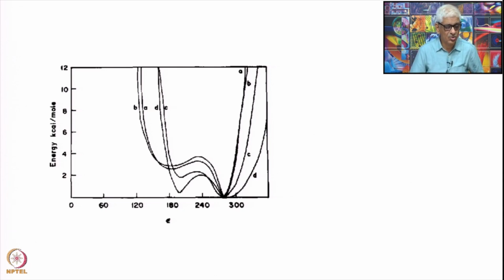Now we turn to one of the torsion angles along the backbone, and that is the epsilon torsion angle, the C3 prime O3 prime torsion angle along the backbone, and this actually is quite restricted. How do we know this is restricted? There is no measurable NMR parameter here to find out this coupling constant, although sometimes you can use the P31 spectra. And here you also determine this by energy calculations.